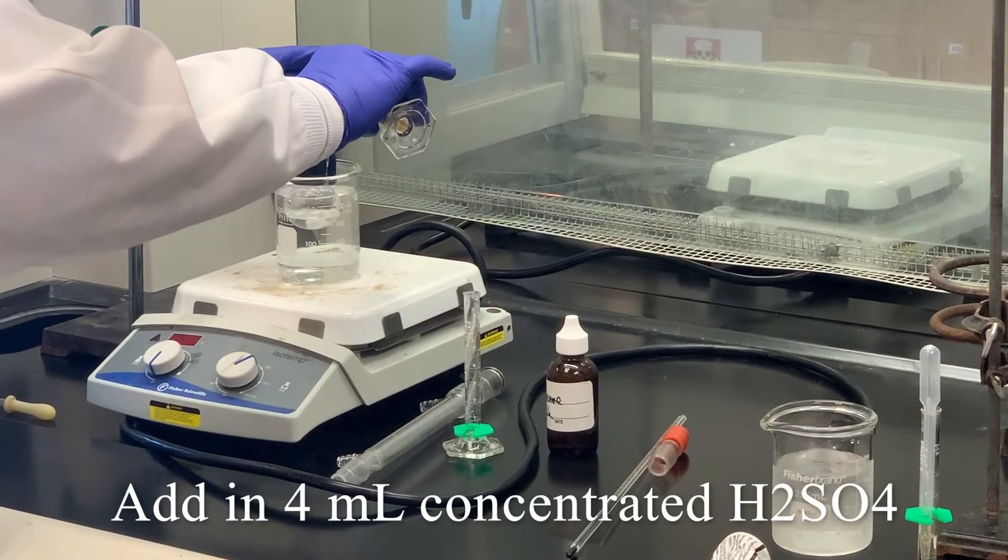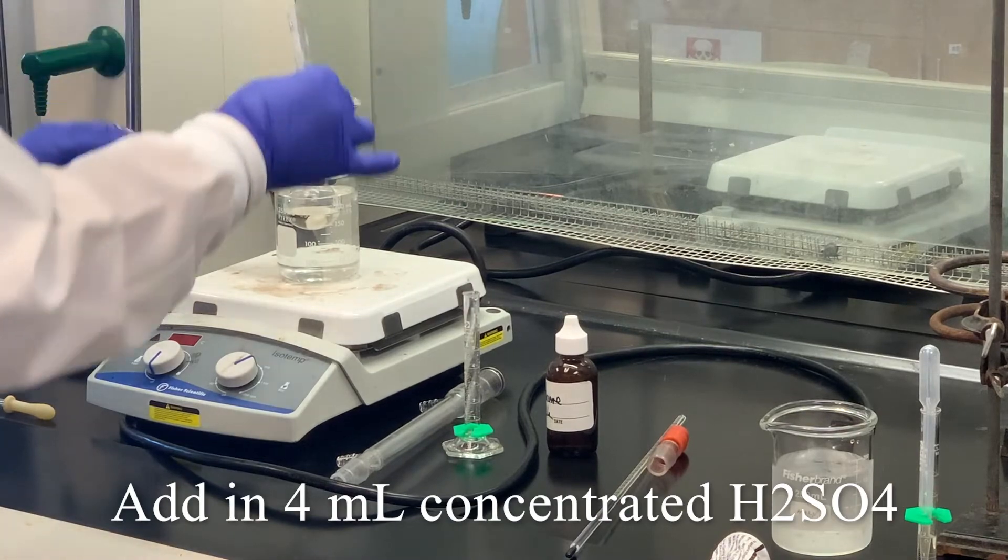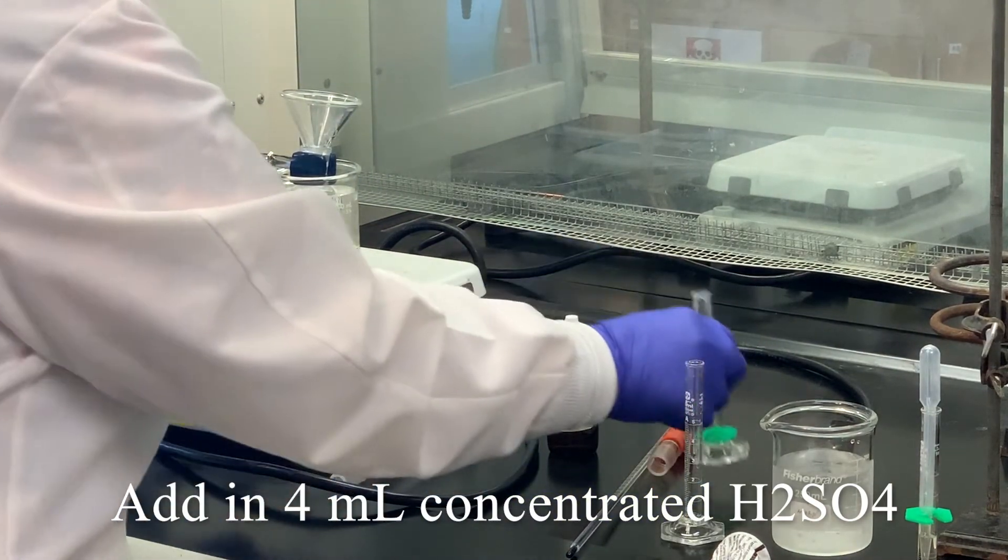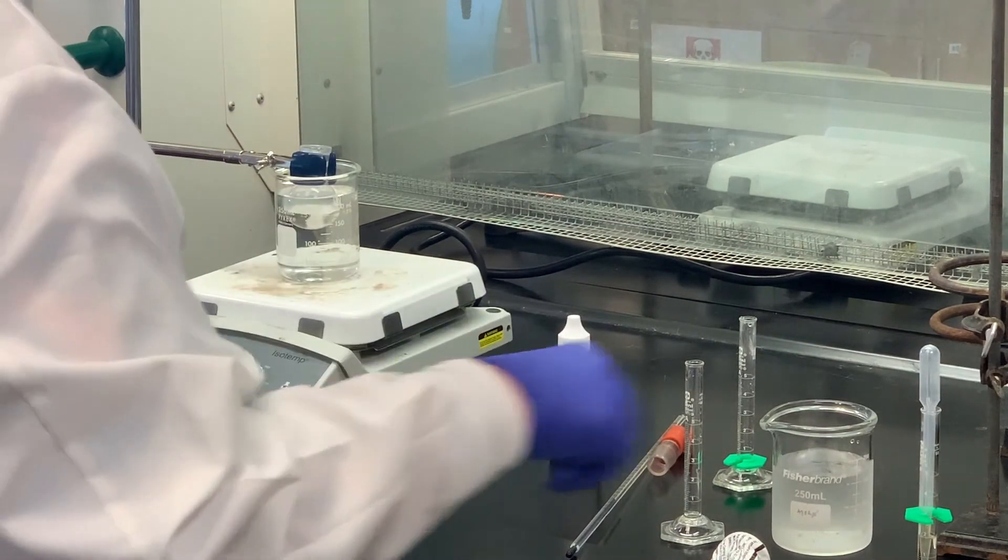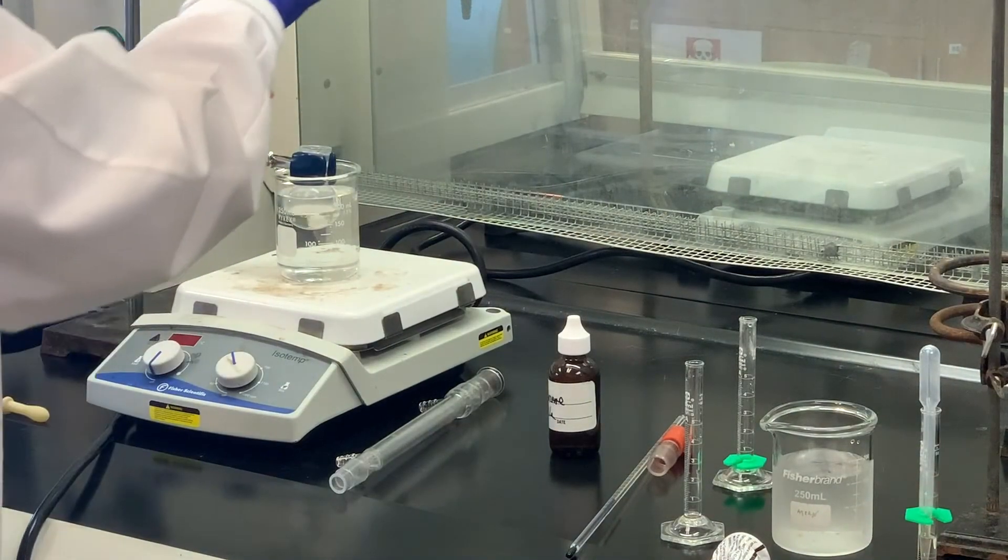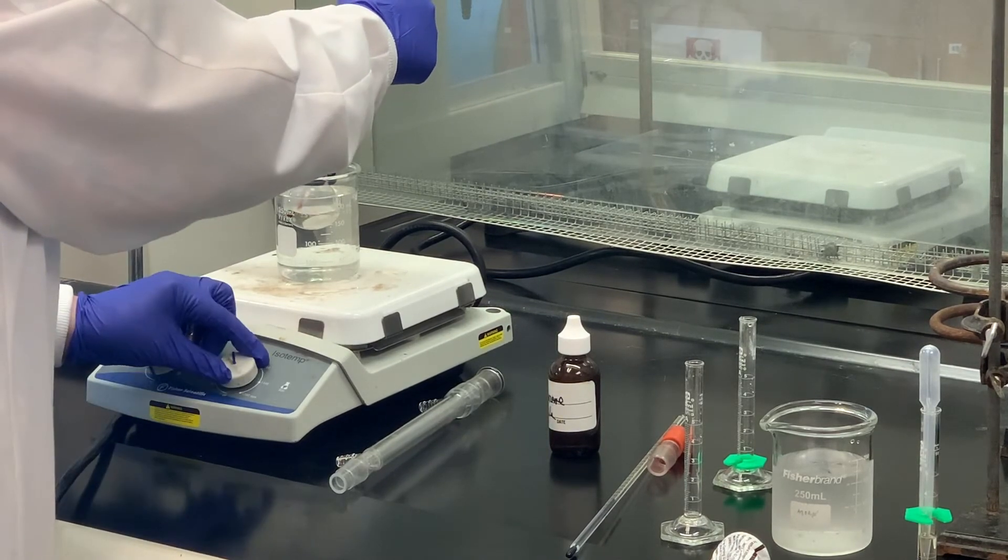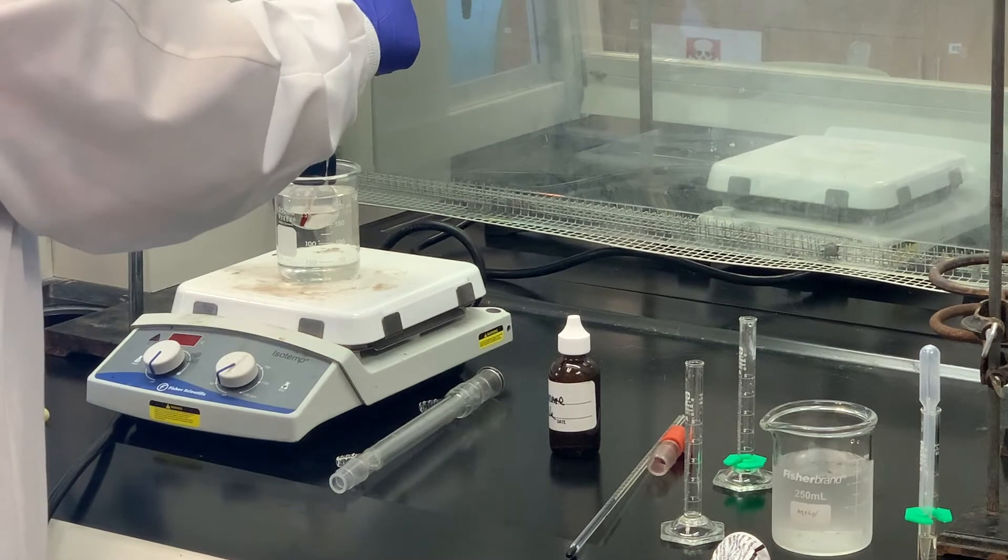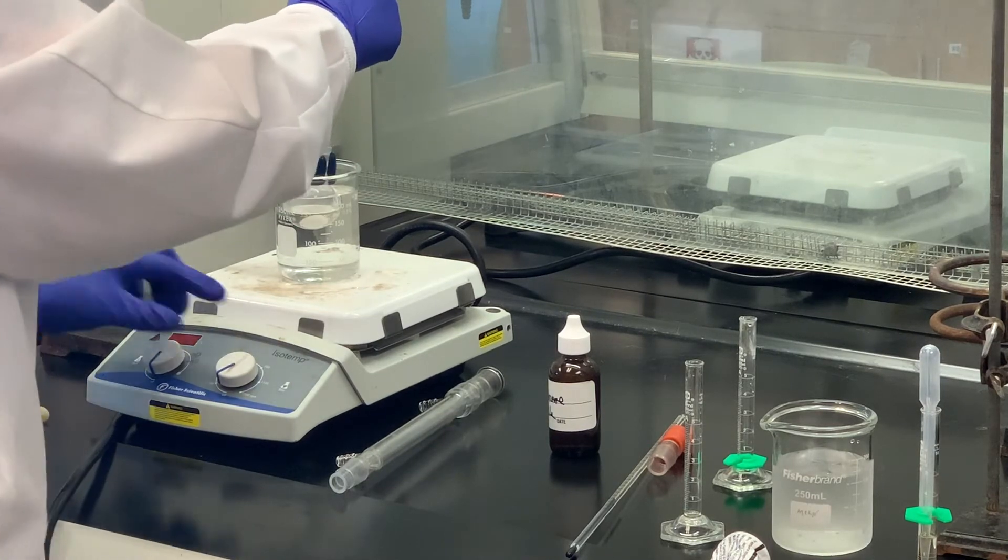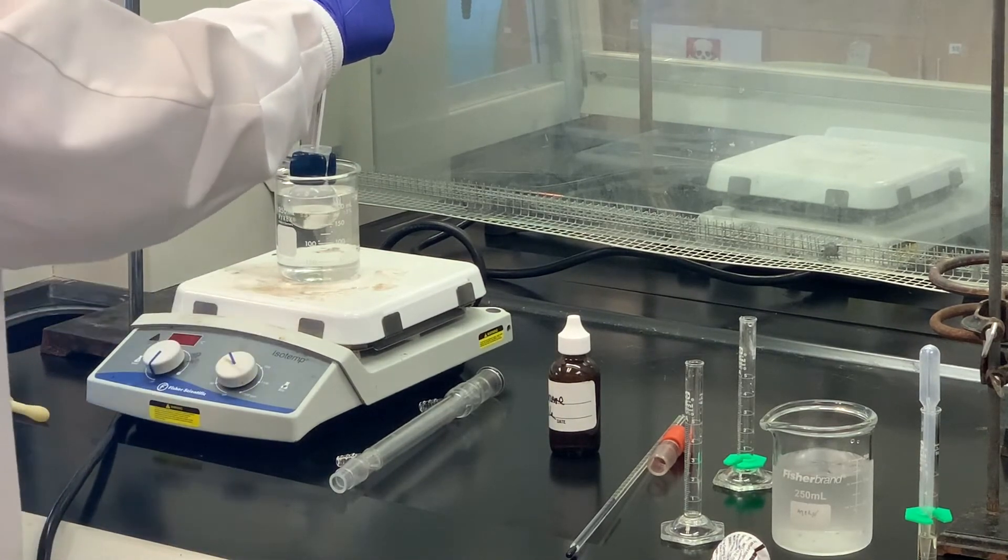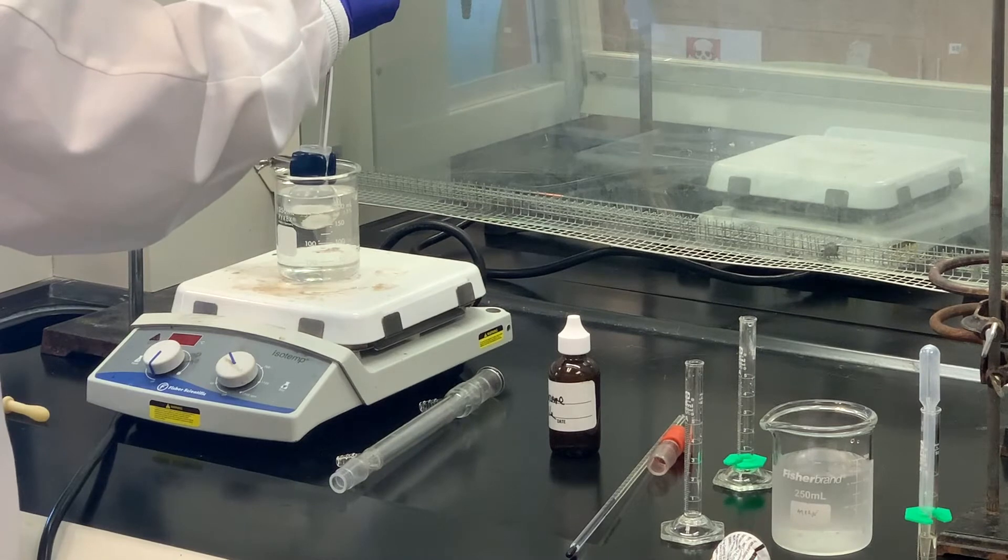Next, I'm going to add the four milliliters of concentrated sulfuric acid. And then I'm going to stir this just to mix it well. I'm going to take a measure of the temperature inside just to see if it has increased. I'm going to stop stirring just so I can get it in there a little bit better. It looks like it's around 40 degrees, close to 40. I'm just going to let that stir. We probably want it closer to 25 before we start. I'll let that stir for a while and recheck it in a couple minutes.